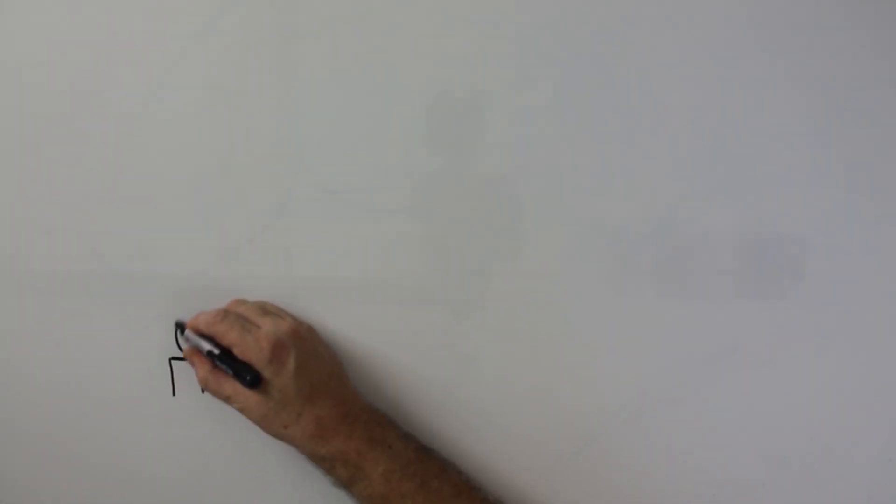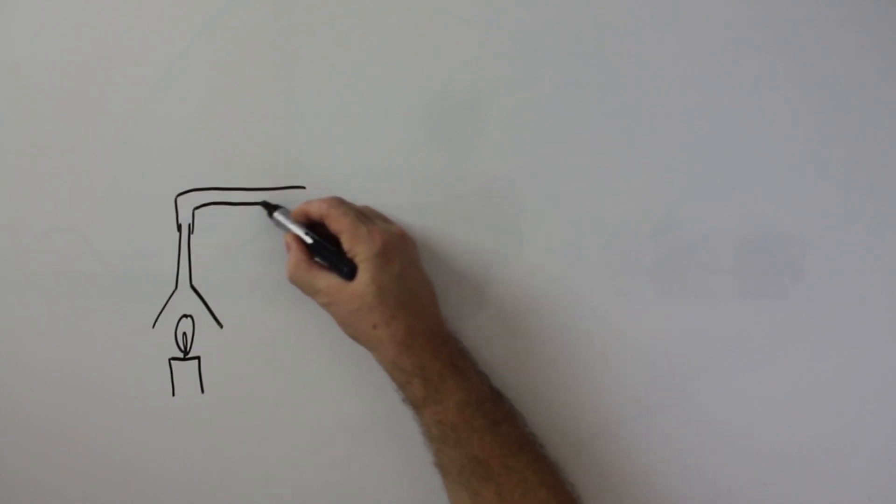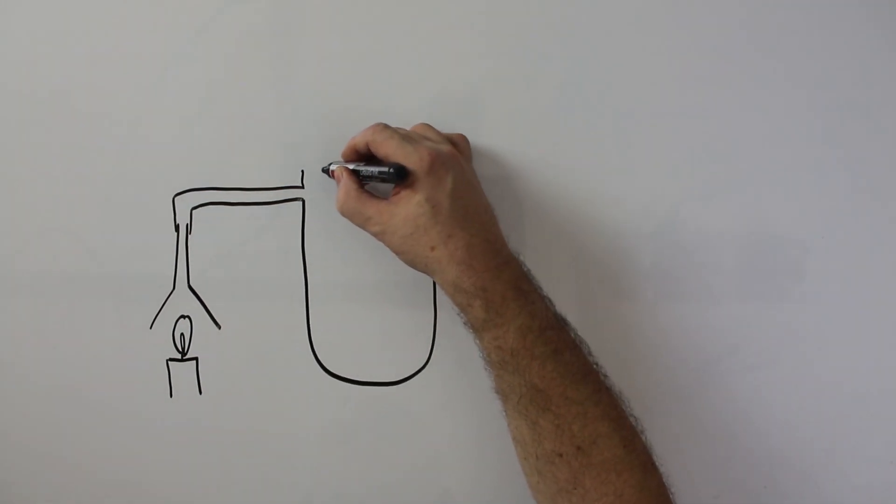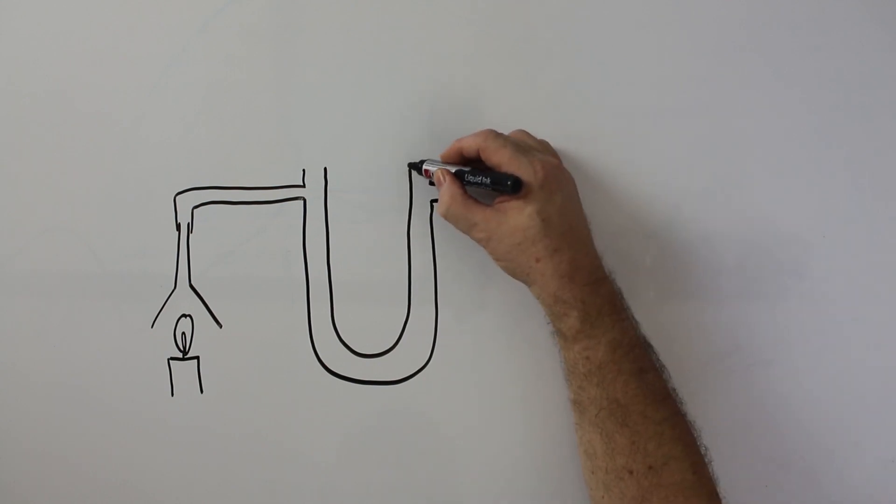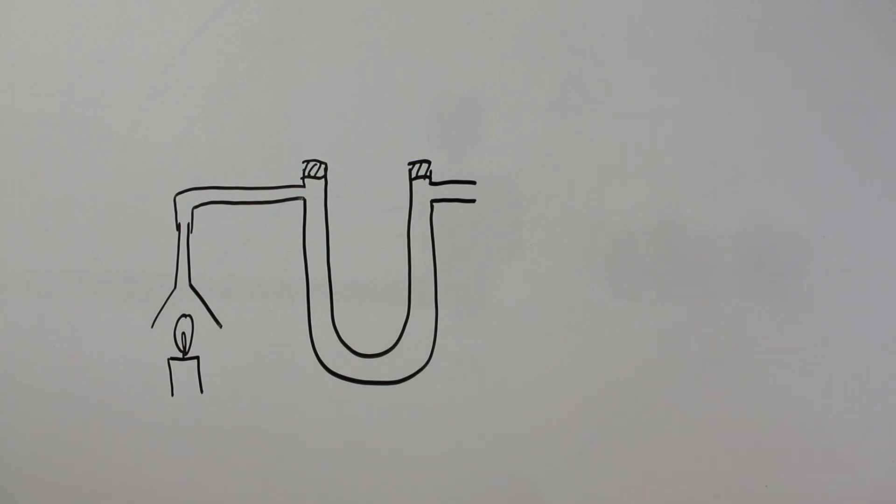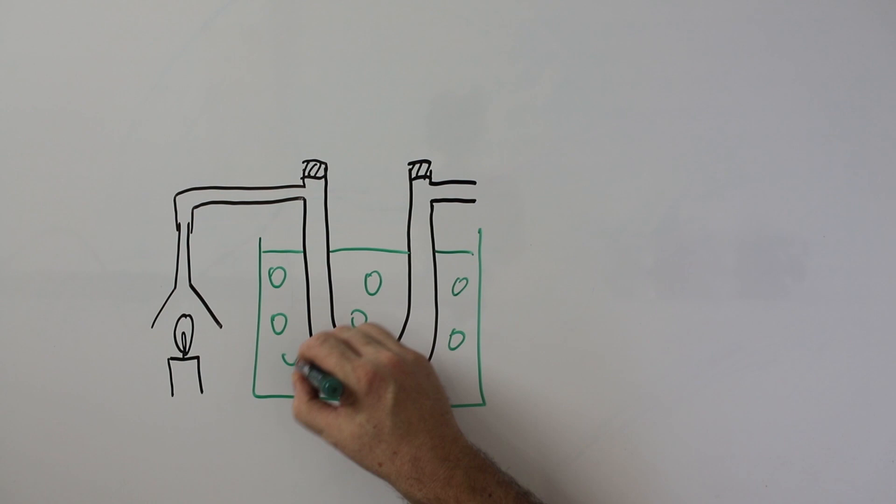We start off with a candle and this has over it a funnel which is connected by a tube to a U-tube. Let's put a bung in there and there. This we can stand inside of a beaker and this beaker contains some ice and some water.